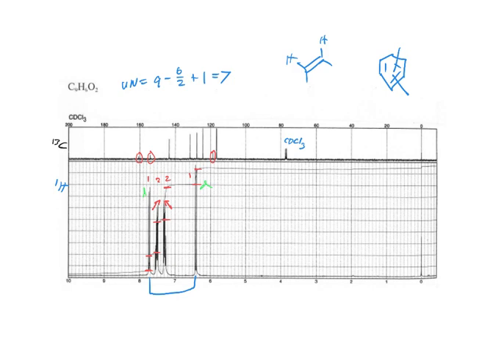Carbonyl, maybe. So if we had a carbonyl, it's likely this most downfield one, but it's almost up to 160. So what kind of carbonyl would that likely be? An ether maybe? Well, an ether isn't a carbonyl, right? You mean an ester? Yeah, so I'd say likely an ester. And because it's pretty far on the upfield side of the esters, what might that mean? It's close to the ring. Right, it's probably conjugated to the ring.